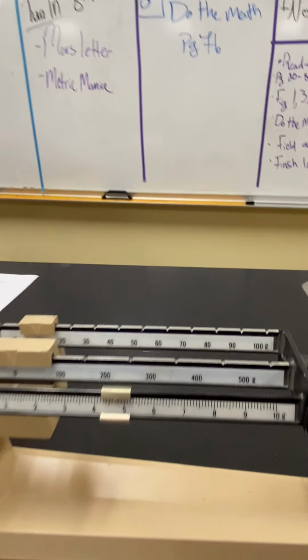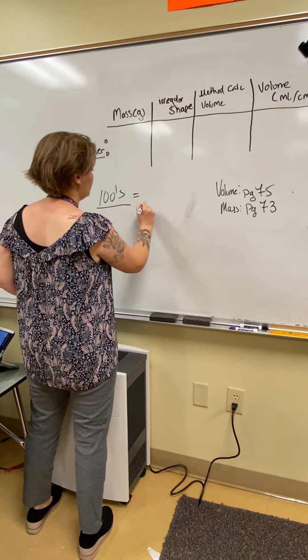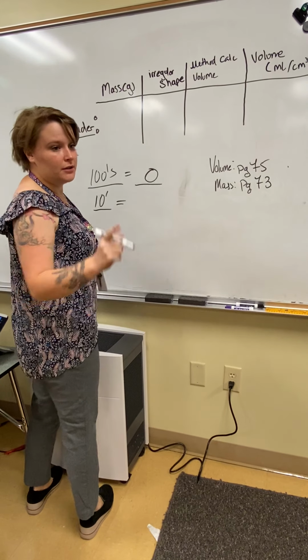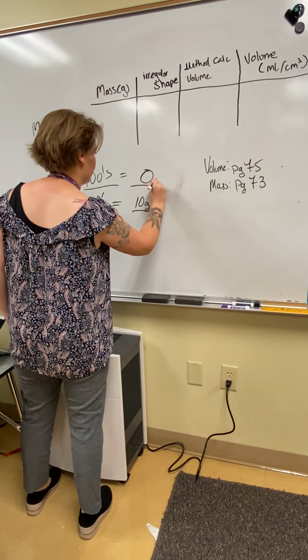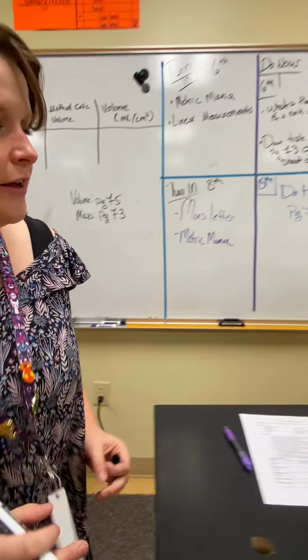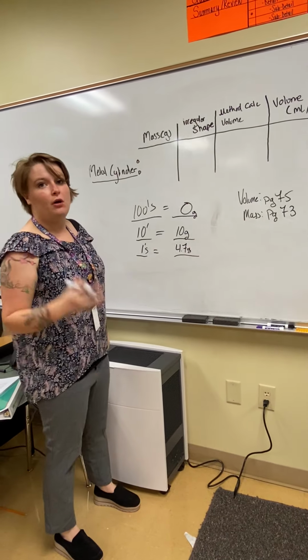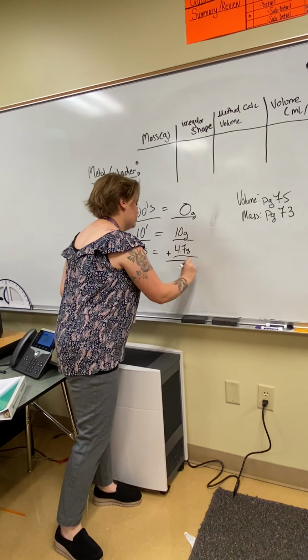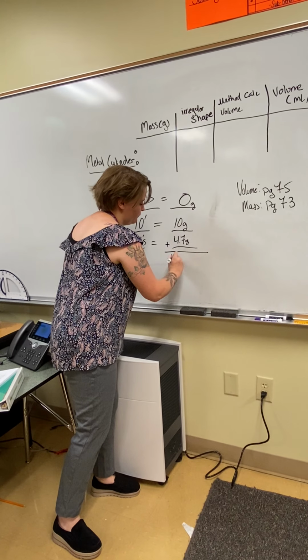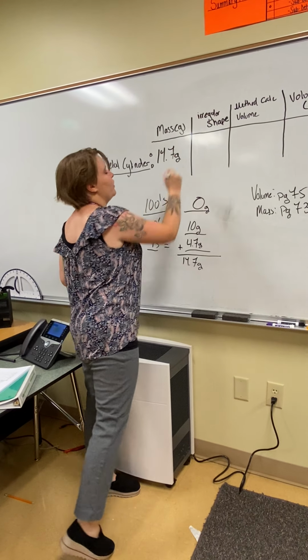So for our hundreds slider, we got zero. There's no hundreds. For our tens, we got 10 grams. Also put grams right here. And now we have our ones, and that equals 4.7 grams. All right, now all you have to do is add all these together, right? So 0 plus 10 is 10, 10 plus 4.7, that's going to be 14.7 grams. All right. That is our mass, so 14.7 grams.